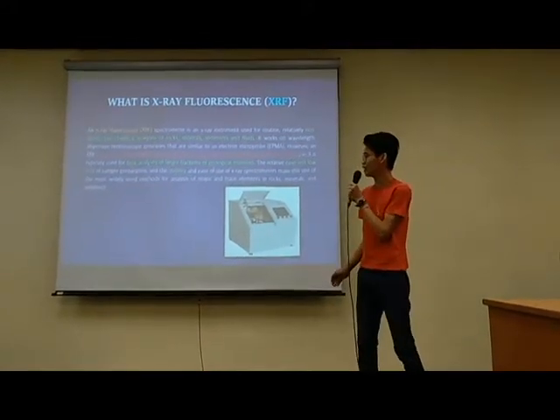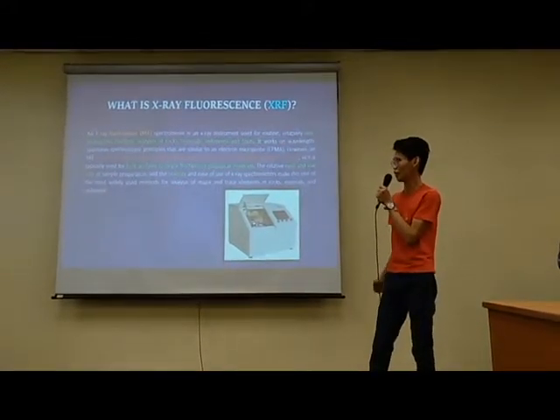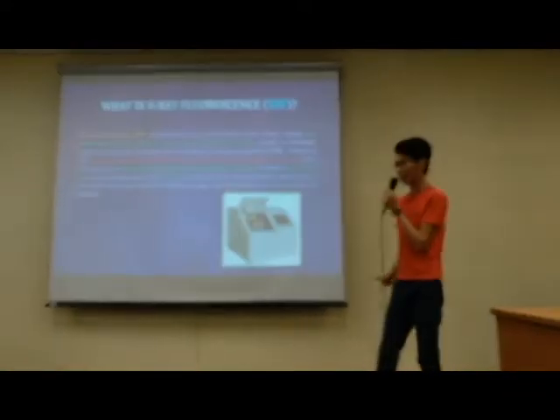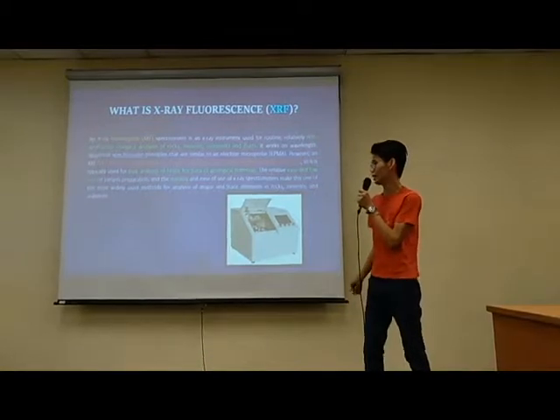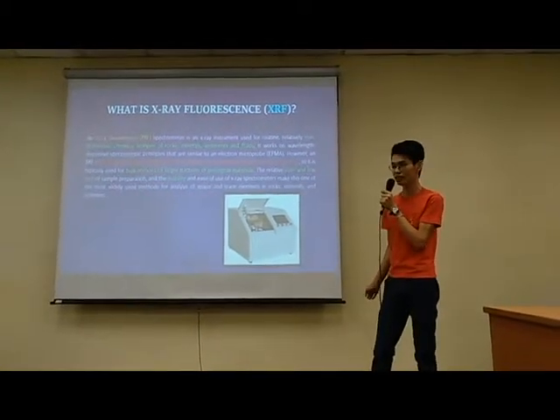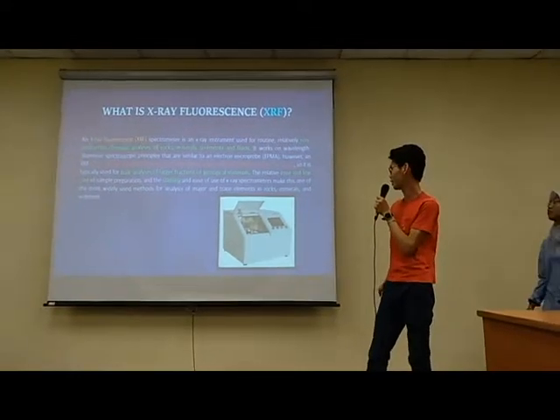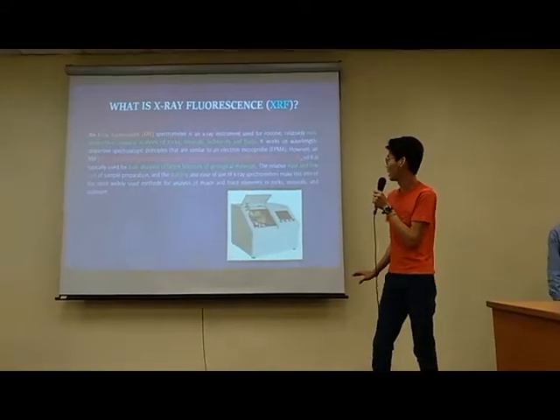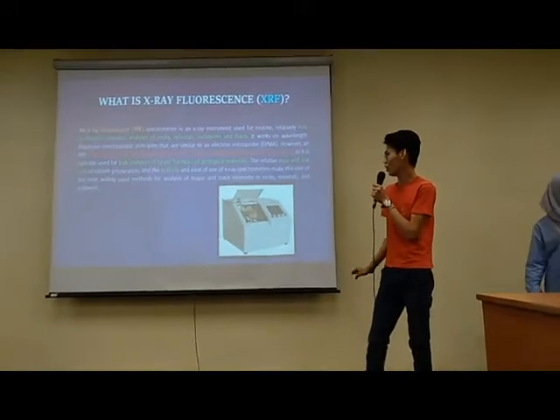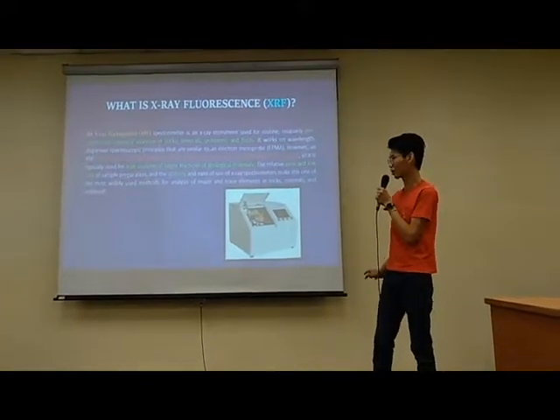So it is typically used for bulk analysis of large fractions of geological materials. It has relatively easy and low-cost sample preparation, and the stability and ease of use of the X-ray spectrometers make XRF the most widely used method for the analysis of major and trace elements in rocks, minerals, and sediment.